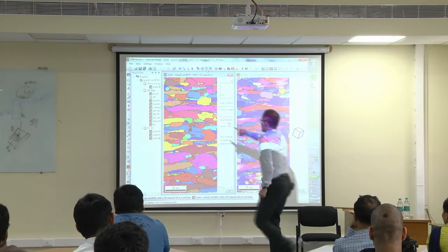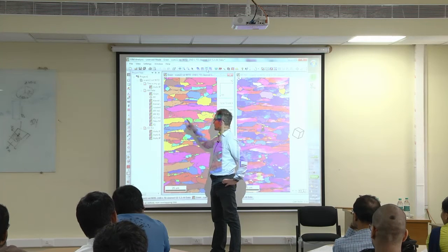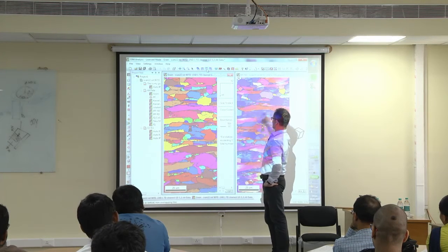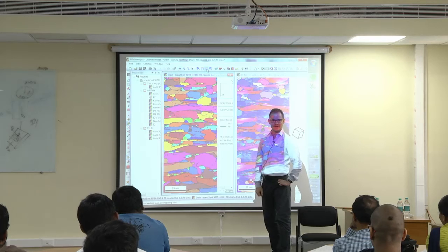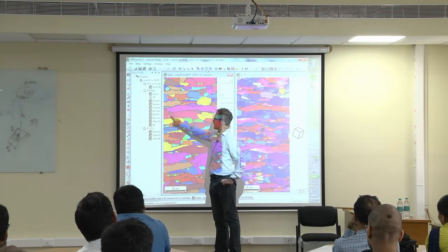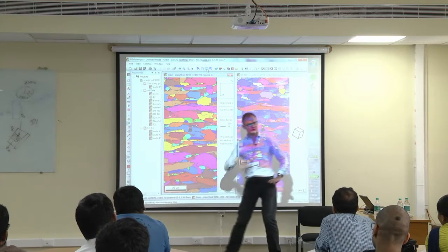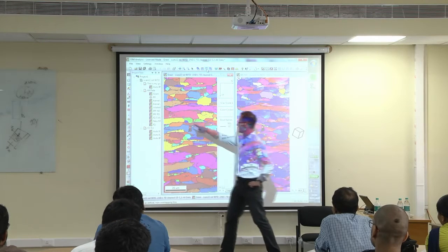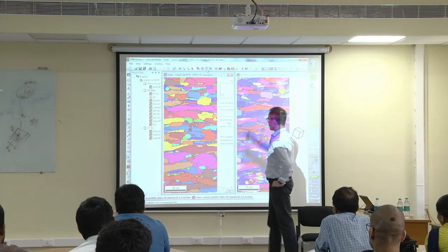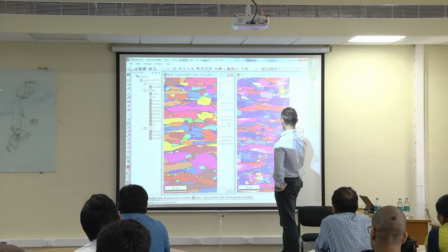Good. Look here. There's a little green area. That means the software considers this to be a new grain, yeah, a separate grain. While in this picture here, it doesn't look like a new grain. And also, this green grain doesn't have a grain boundary all around. On one side, it obviously has. I plotted grain boundaries larger than 15-degree misorientation, but this grain obviously has 15 degrees only on one side, on the other side not. So why is it considered to be a new grain? And something similar we'll probably find somewhere else.